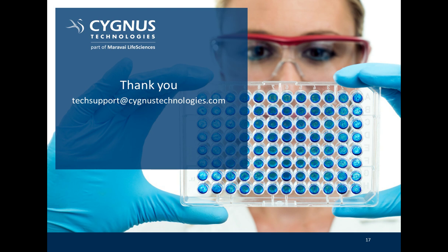And do you recommend performing AEMS coverage on both upstream harvest material and final drug substance? Absolutely. So those two samples are really important for different reasons. So for the upstream coverage analysis, it's important to show that the antibodies in the kit that you're using are broadly reactive to all or at least most of the host cell proteins that are potentially going to find their way into the product.